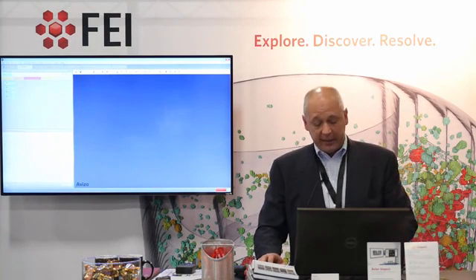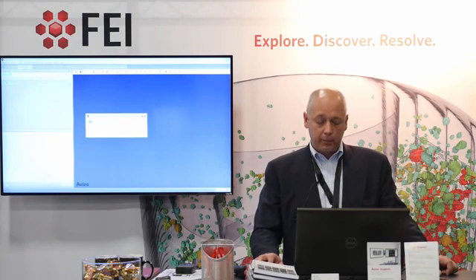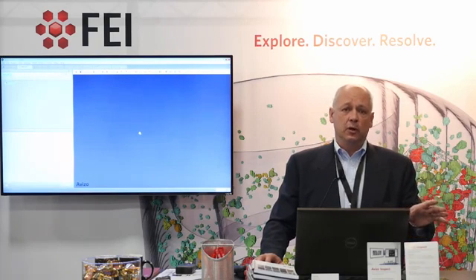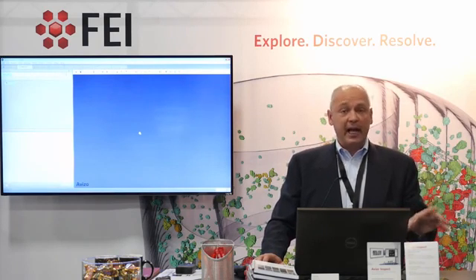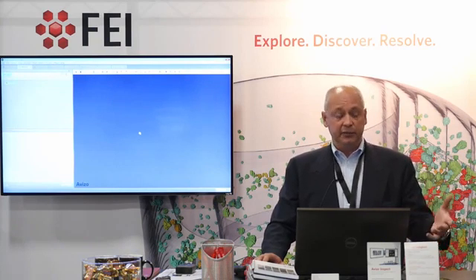Okay, something else I want to show you is the ability to create what we call recipes. And a recipe is a way to automate not only the measurement, the dimensional metrology I was speaking about, but the ability to actually do some image processing, advanced image processing workflow on your data, and then repeat this recipe on different data sets. So I'm going to take a very simple example there.